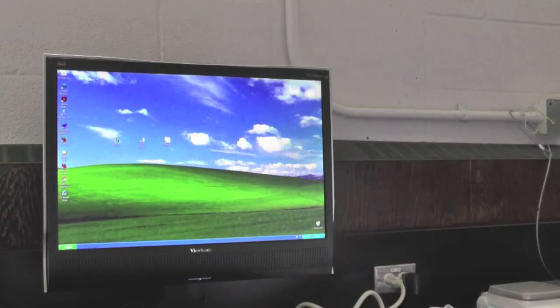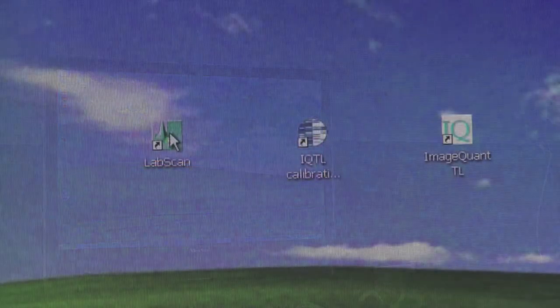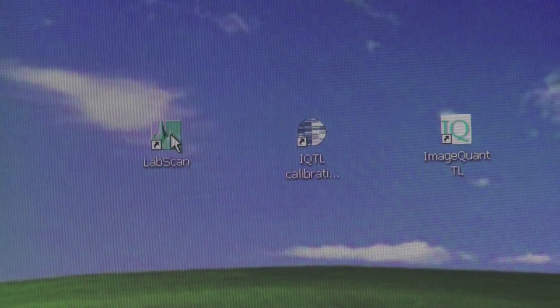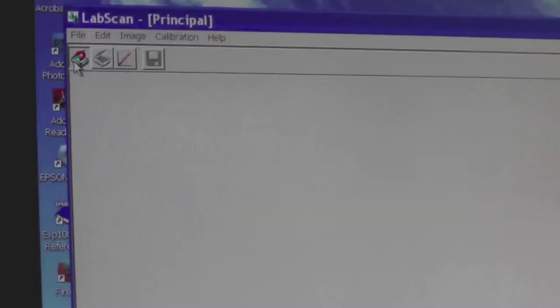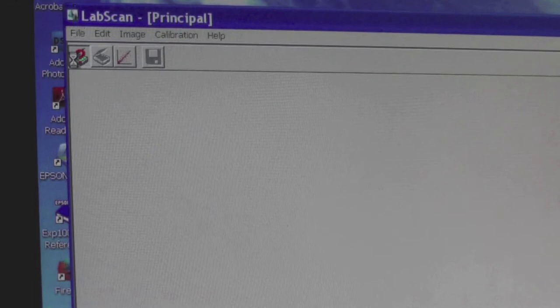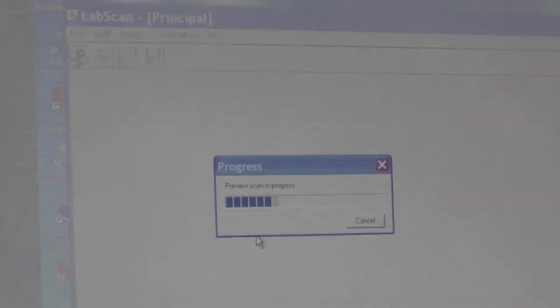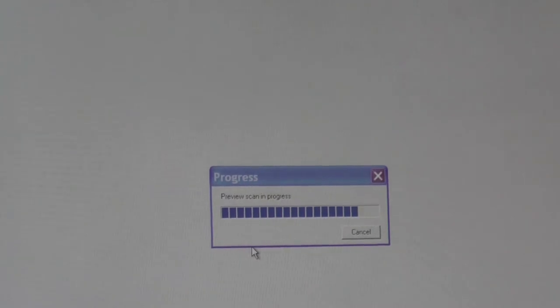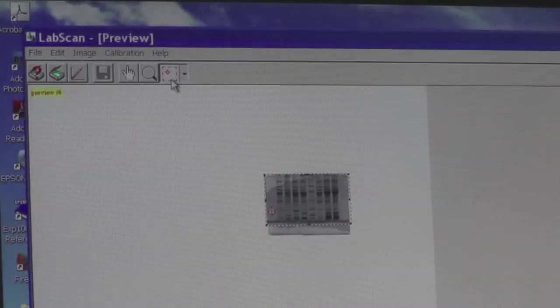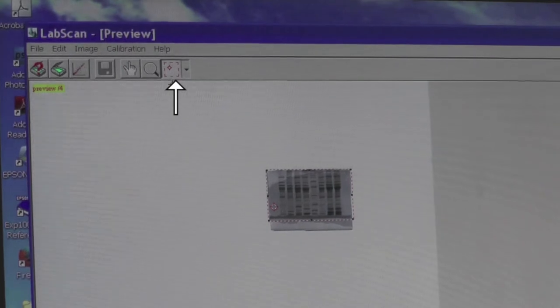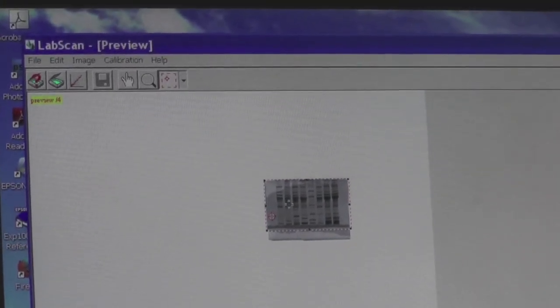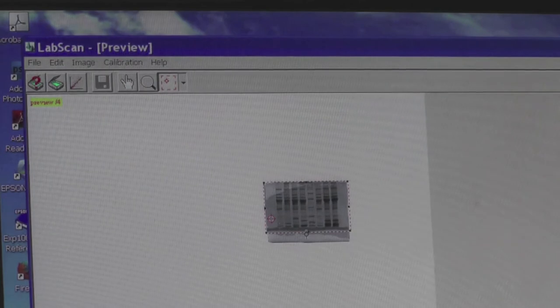With your gel loaded onto the scanner, open up the LabScan software on the computer. Click on the scanner icon with a question mark to obtain a preview of your gel. Once the preview appears, use the crop tool to draw a rectangle around your gel in order to crop out the bottom. Make sure you do not cut out any bands or lanes.